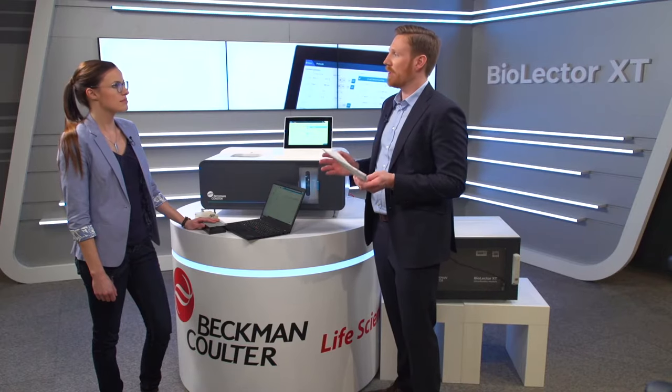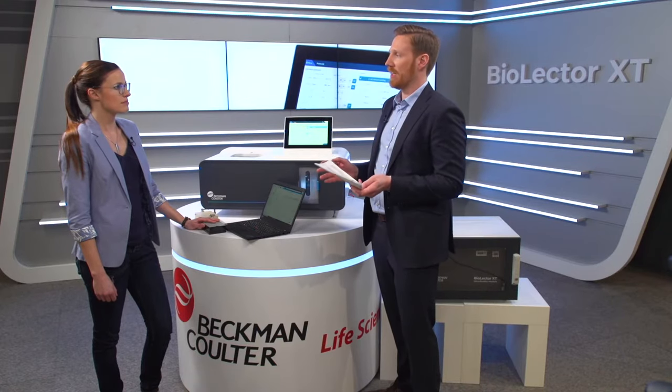Welcome to our live product demonstration in which Anna from Technical Product Management will guide you. Anna, please tell us about your experiences with running experiments in the new BioLector XT. Sure, I'm happy to do so.